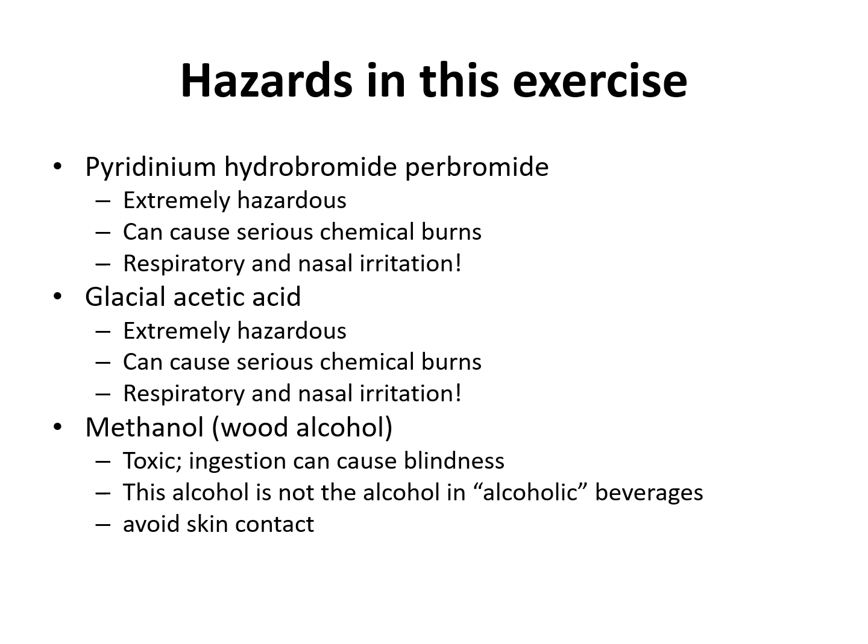Safety issues for this lab, please remember to understand that the chemicals we're using in this experiment are dangerous. In fact, not only in this experiment, in most organic chemistry experiments, they are volatile, toxic, or hazardous, any of those properties that we have in the lab.